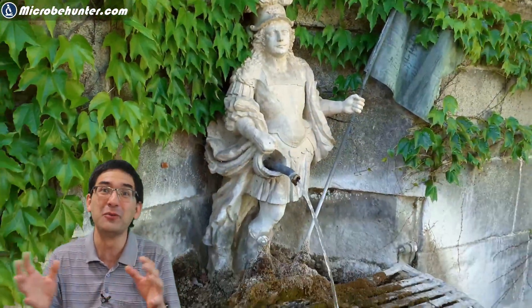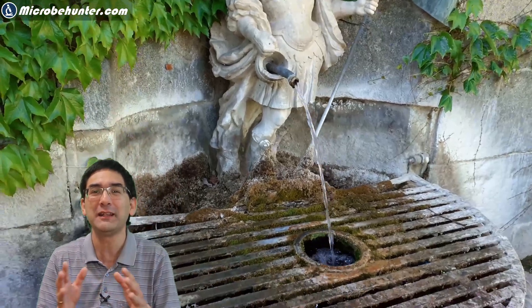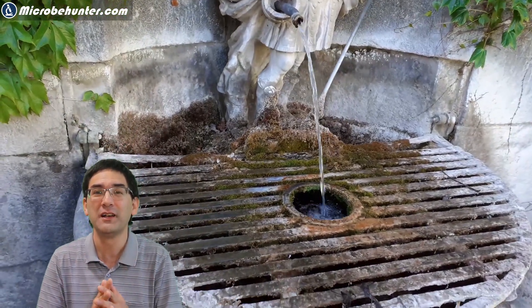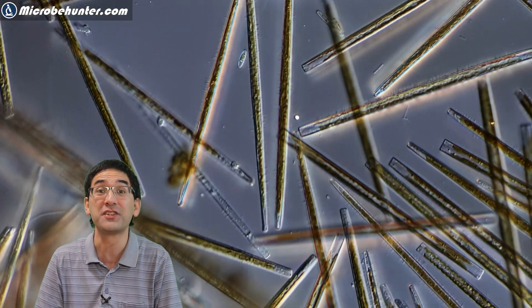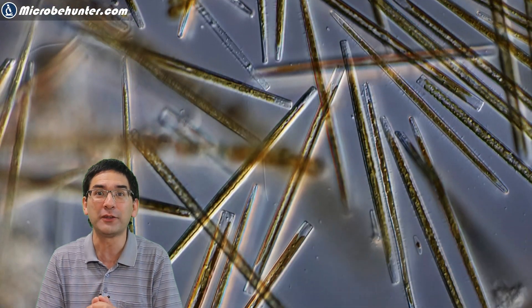Even those microorganisms that are moving around fairly freely like to be around a solid surface because they like to feed on solid material. Here we have already got some of this solid material—these are the diatoms that I found.